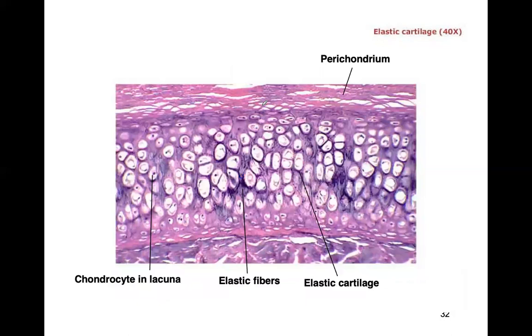That's hyaline cartilage. Elastic cartilage is a little bit different. Elastic cartilage is what we see here, made up of elastic fibers.